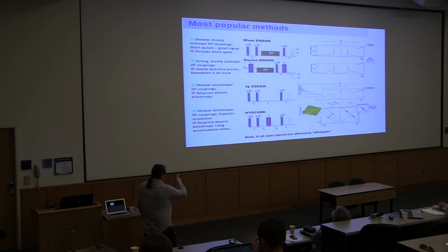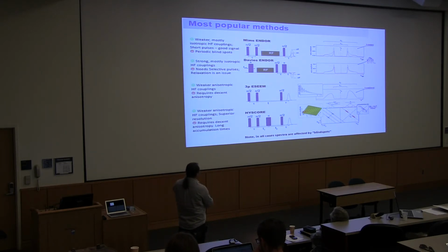In the EPR2 folder, there is a poster that I uploaded. This is the poster we have hanging next to the EPR machine, and it's a really cool cheat sheet that you can use for remembering which sequence is what. There are two most commonly used pulse sequences for ENDOR, Mims and Davies. They have a different setup.